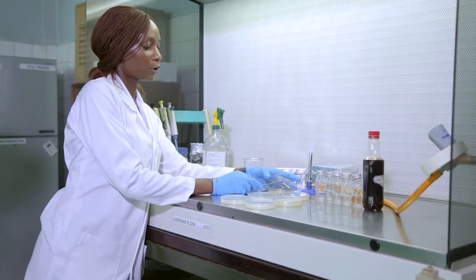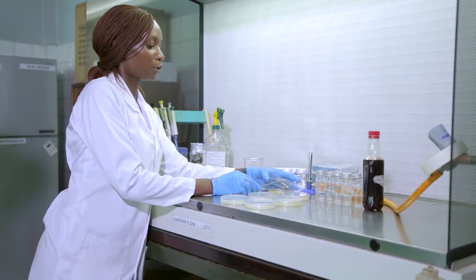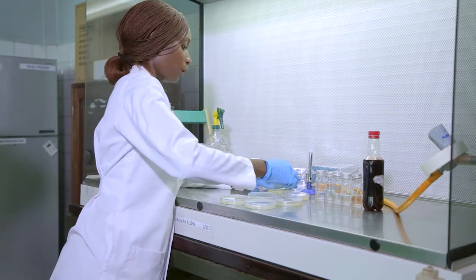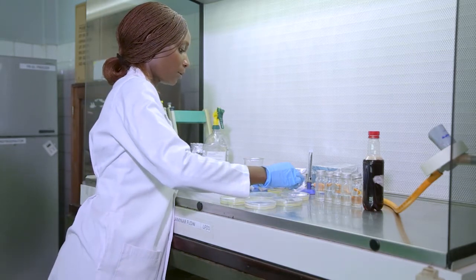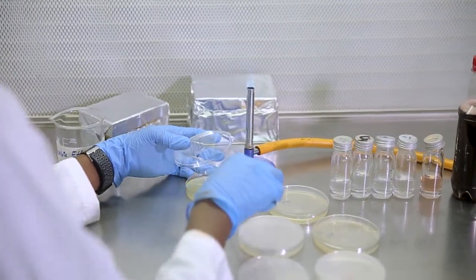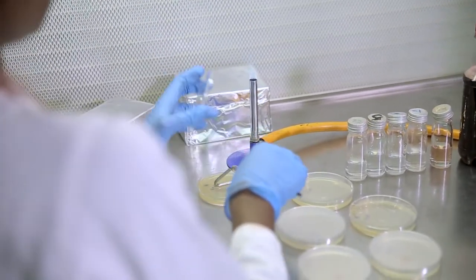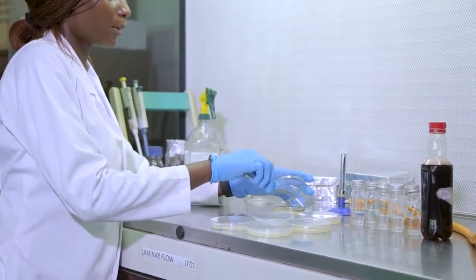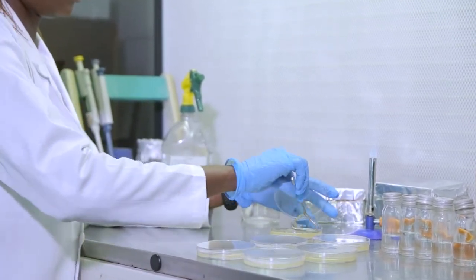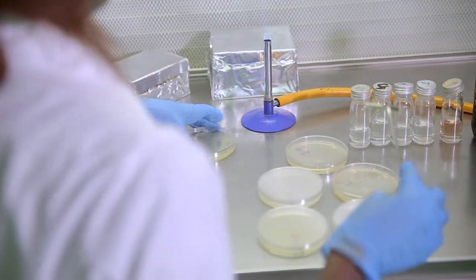Okay, you let it touch any part of the agar that is free of the inoculum such that it can cool. But you also make sure not to overexpose the petri dish to air. You may change different parts of the agar surface just to ensure that the rod is cool. Having done that, then I can spread the inoculum. So you make sure you're close to the flame, and then you keep turning. You notice this finger of mine keeps rotating the petri dish. So you make sure that the inoculum is evenly distributed on the surface of the agar.